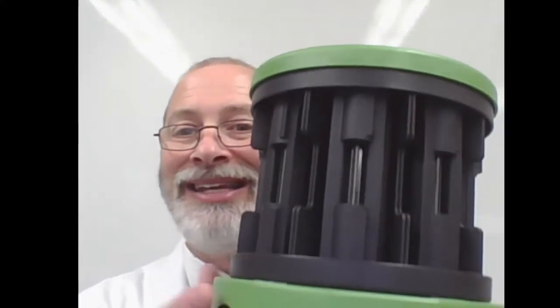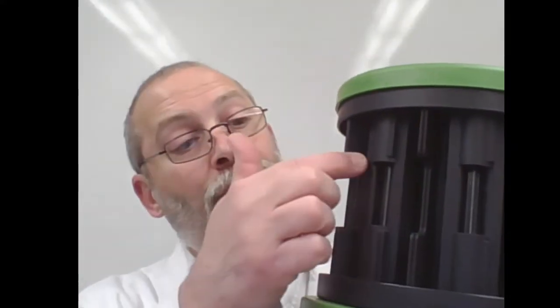This device enables us to send electricity through the glass tubes and energize the element in a gaseous form so that it becomes a luminous body. During this activity, we're going to have the lights off so that we can see the luminous body better as we use our spectroscope to make our observations.